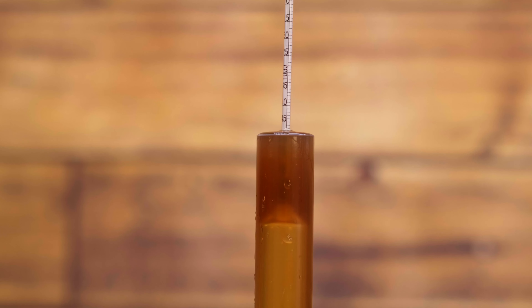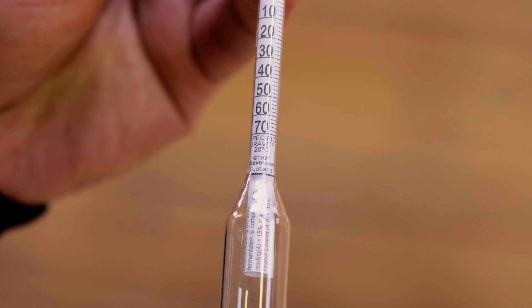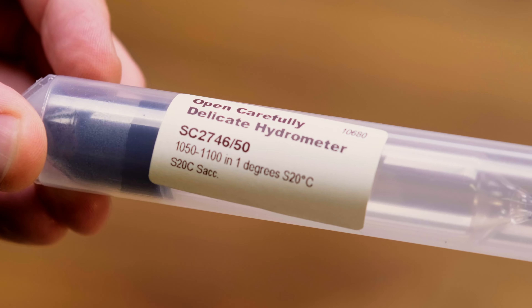We do have really narrow gauge hydrometers specifically made for us — a starting hydrometer and a finishing hydrometer. The scale on those is a lot narrower, making accurate readings much, much easier. These glass hydrometers are actually precision instruments measuring the amount of sugar dissolved within a liquid. For each of the glass hydrometers there will be a specific temperature that they're calibrated to. The ones that we sell are all calibrated to 20 degrees.